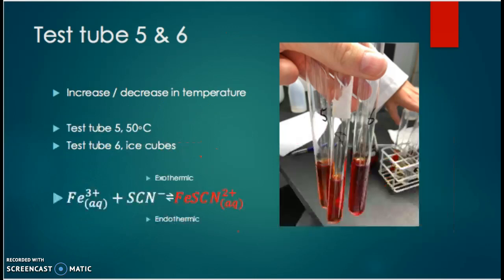In the last two test tubes, five and six, we tried to increase and decrease the temperature. Test tube five was placed in a water bath at 50 degrees for a few minutes, and test tube six was placed in a water bath with ice cubes. We observed that in test tube five, with the increased temperature, it turned to a lighter red. This is because the forward reaction to the right — forming iron thiocyanate — is exothermic. So when we increase the temperature, the reaction to the left will occur to reduce the heat, and since it is endothermic to the left, more reactants will be produced.